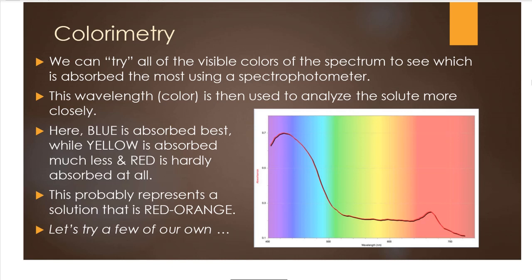That red curve you see through the middle obviously is very high over in the purple and blue wavelengths. It's very low on the far right side over on the reddish wavelengths, and in the middle there's some variations in height. But what you want to do is look for the place where the color is the highest. Right?